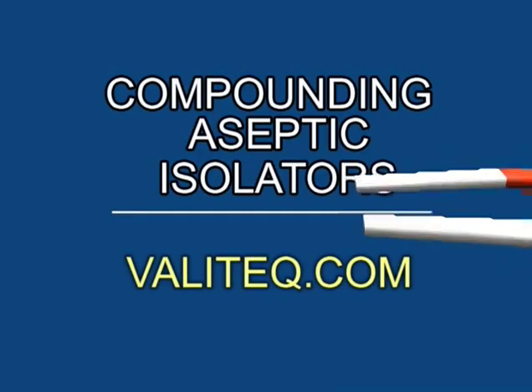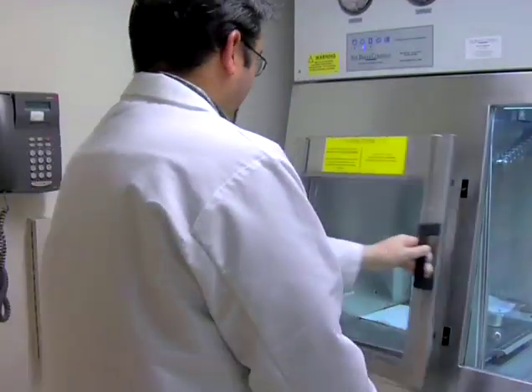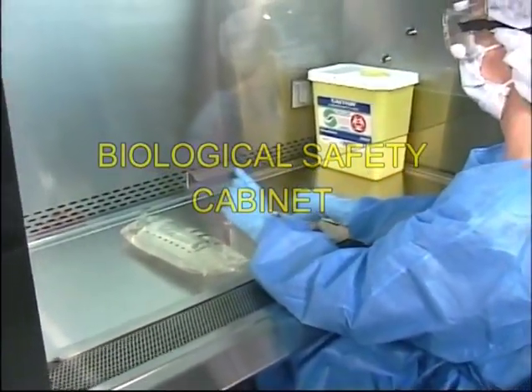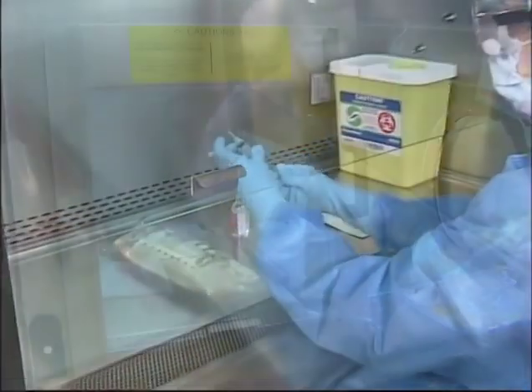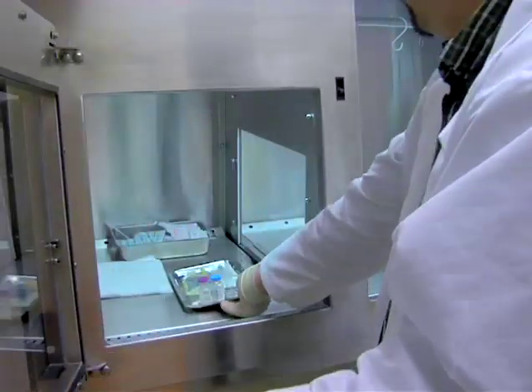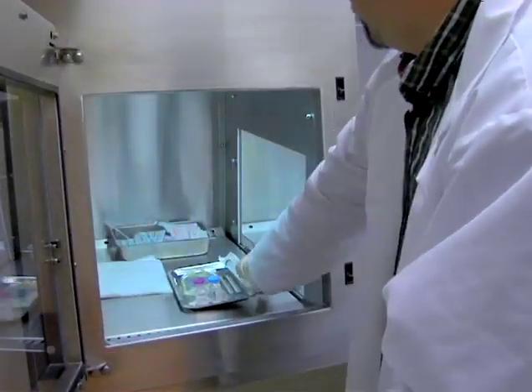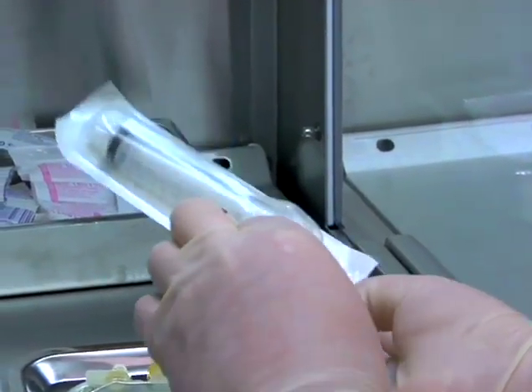In operational terms, the unidirectional airflow CAI functions in a manner similar to the Biological Safety Cabinet, or BSC, with similar airflow patterns. Compounding personnel must learn and unvaryingly follow the proper procedures for introducing materials and removing finished preparations and waste materials from this new type of unit.